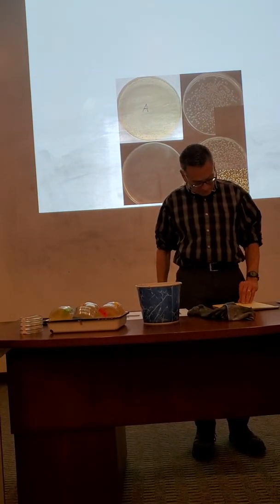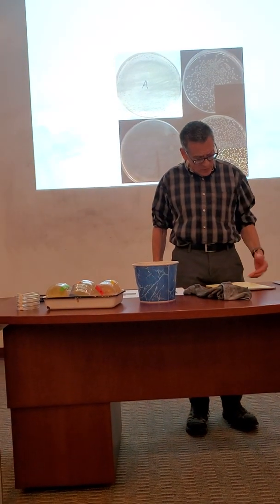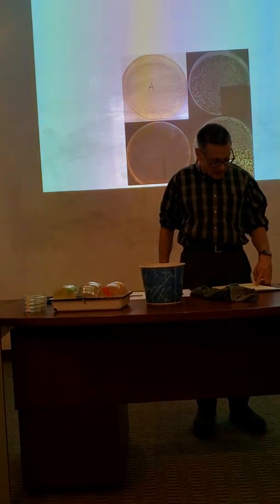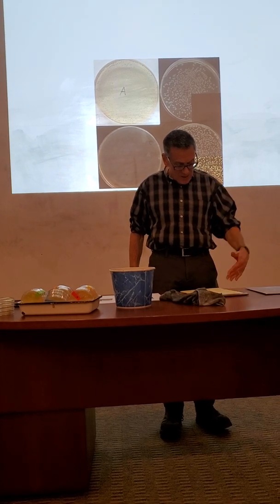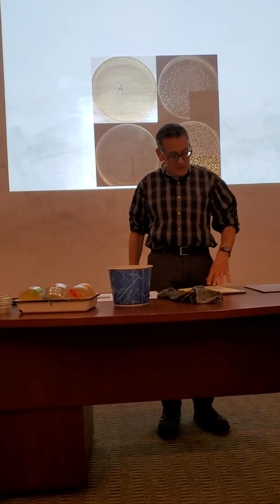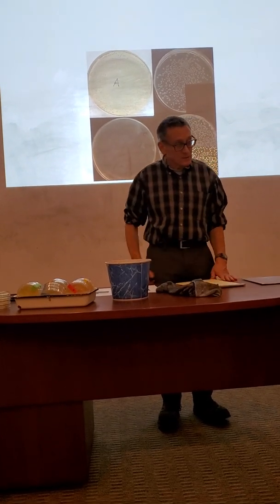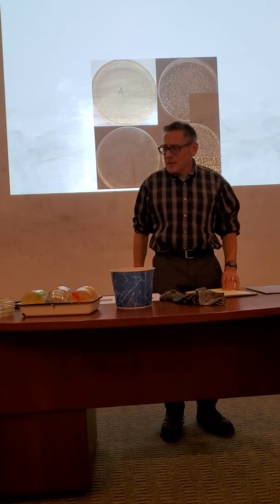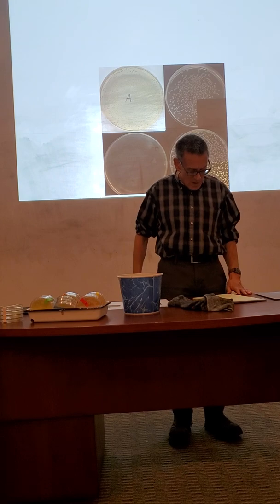Sequence the damn thing. I think to come up with a title, what I generally do is I make a list of words. Here's my list. Phenotypes, E. coli, transformation, XGAL, ampicillin, PUC18, PUC18 lambda, water only, PLux. Those seem to be the important ideas. I couldn't get them all in the title, but I got some of them in the title. That seemed to describe what I was looking at. I didn't name the plasmids in the title. It seemed too lengthy. I do want to name them down below.